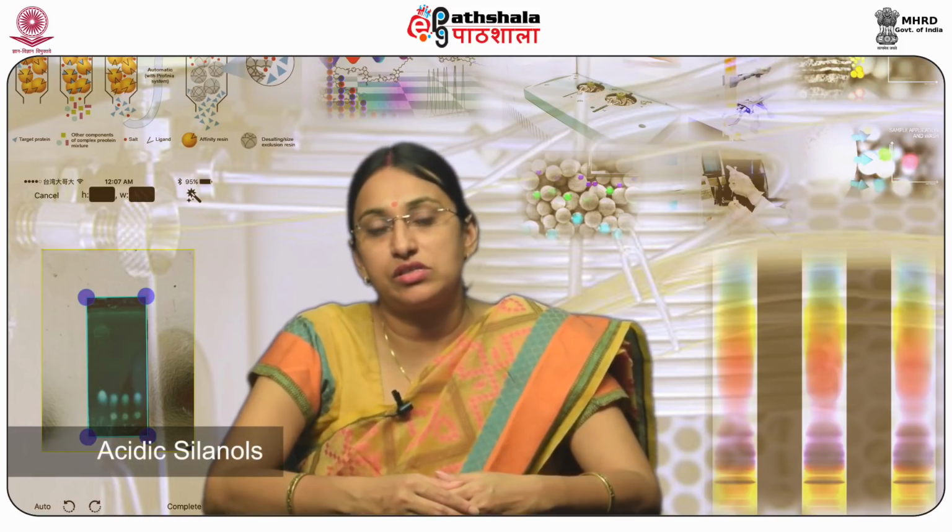End capping. End capping is the process of bonding short hydrocarbon chains to free silanols remaining after the primary bonded phase has been added to the silica base. It is applied only to reversed phase chromatography. It reduces the peak tailing of the polar solutes that interact with mostly acidic silanols. Non-end capped packings provide a different selectivity than do the end capped packings, especially for the polar samples.